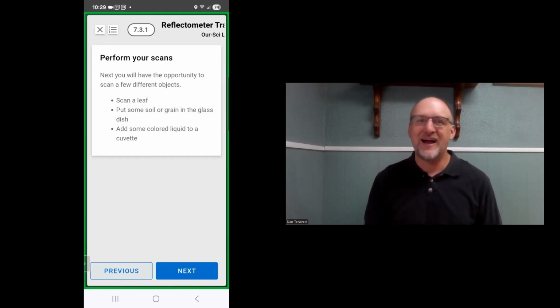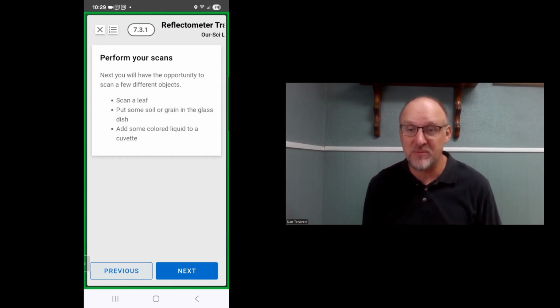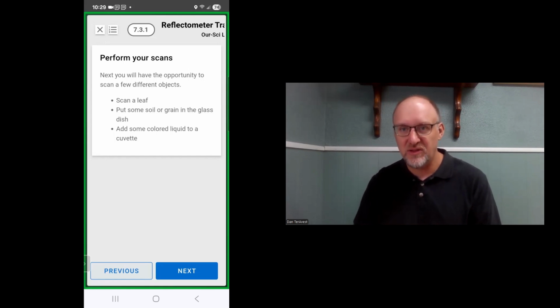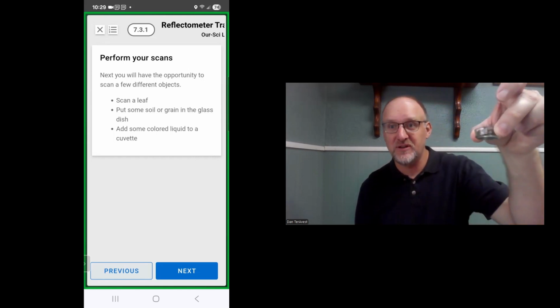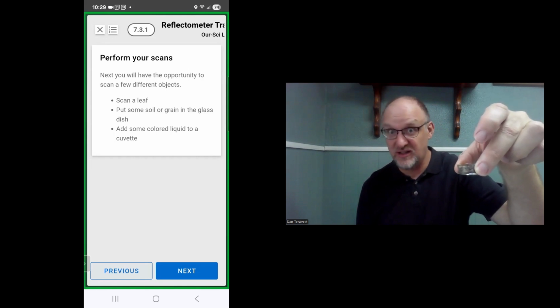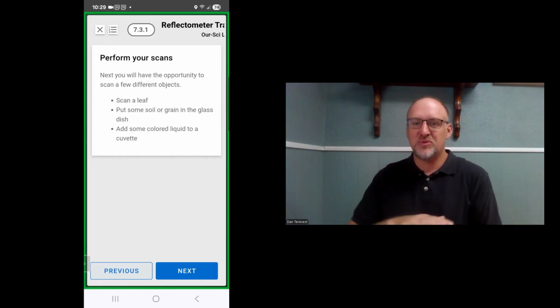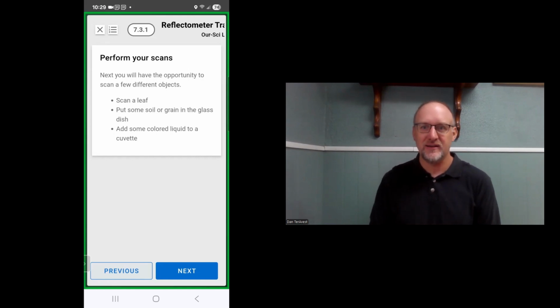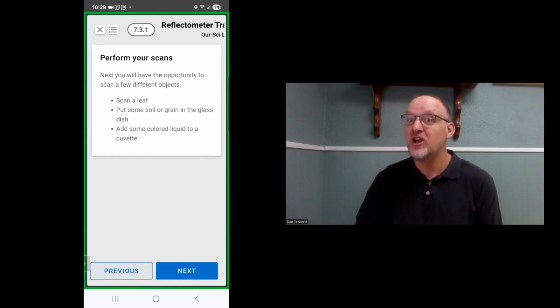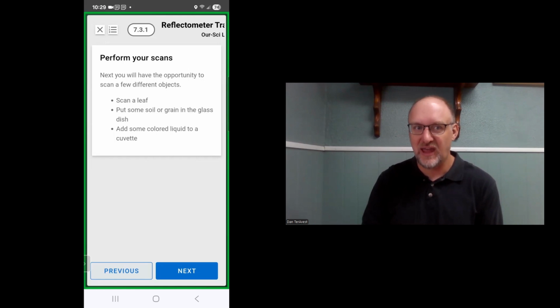If you're not able to sample during a distinct dry season when the soil might be moist, the best thing to do is bring something like a black plastic sheet with you. So you collect your soil, homogenize it, take a small subsample to fill your soil dish, right? This is a pretty small dish, so you don't need a lot of soil. Then spread that out on a black plastic sheet, like a garbage bag, thinly, and within 5 to 20 minutes, depending on how bright or intense the sun is, you should have a dry soil that you can scan.